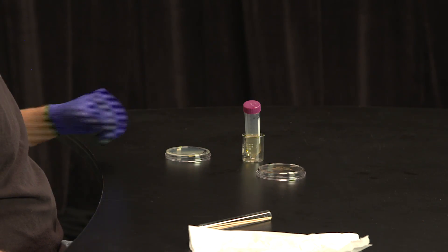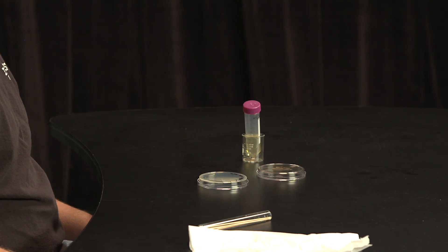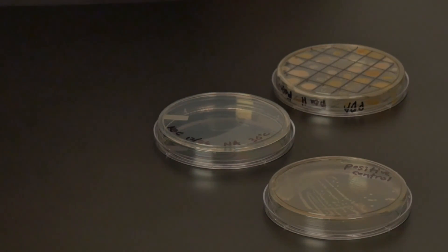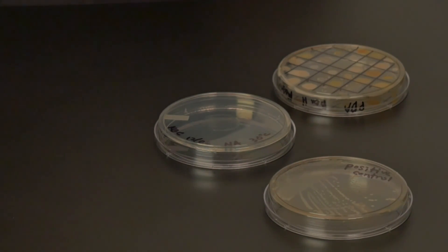Gather your materials around you so that you don't have to move around once you begin plating. Obtain a sterile petri plate that contains the same media that you previously used to show a zone of inhibition. Take some sterile toothpicks, swabs, your master plate, and the positive control. Label your new plate with your name, date, media type, and incubation temperature.